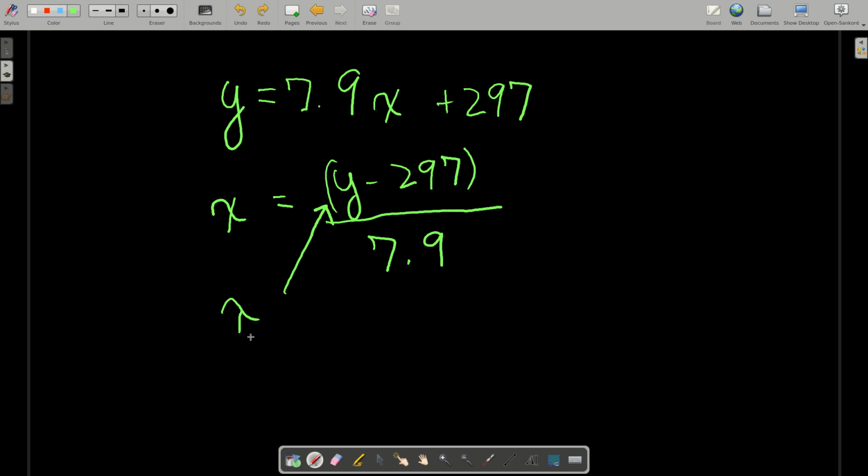All you do is plug in the lambda max that you measured for your unknown, and you get your answer. I don't remember the numbers, but for your slope and y-intercept, if you used Calc, you don't have to use all those numbers. 3 or 4 sig figs for each is fine, and that's it.